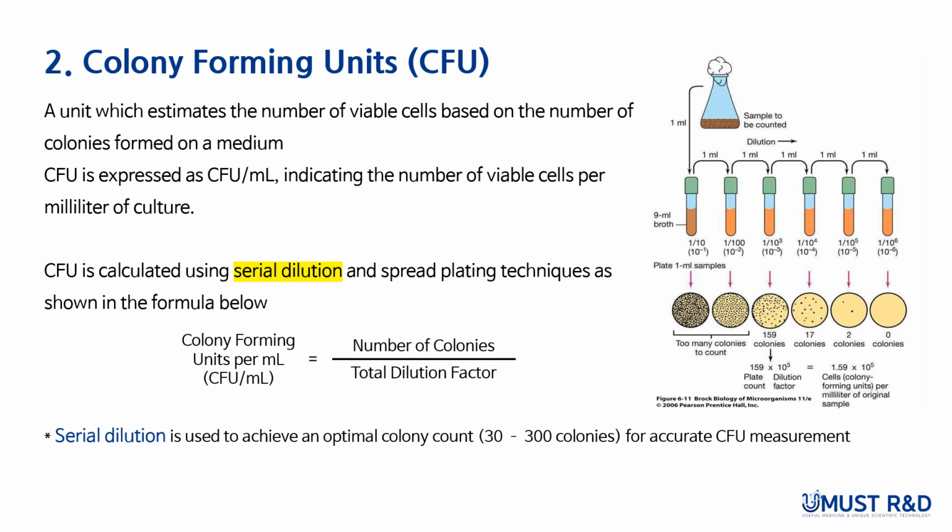For the past 4 lectures, we have covered the fundamental techniques for microbial culture. In Chapter 1, we explored the importance of sterilization and its methods. Chapter 2 introduced concentration calculation and buffer solutions. Chapter 3 showed different types of culture media and their characteristics. And Chapter 4 focused on culturing techniques and the streaking method. I hope this information has been useful and helps you with culturing microorganisms in the lab.